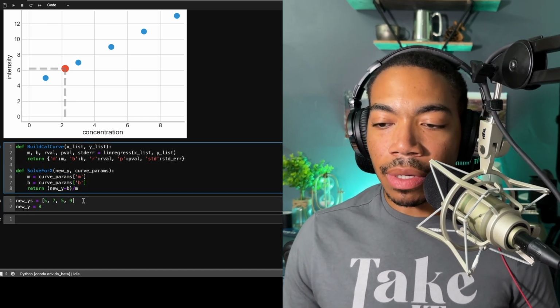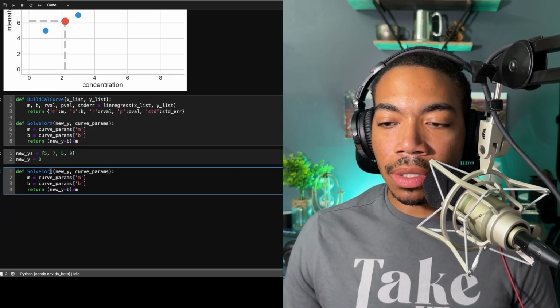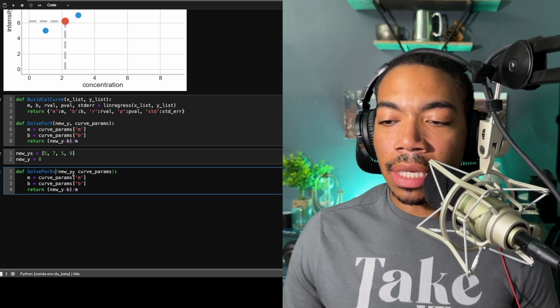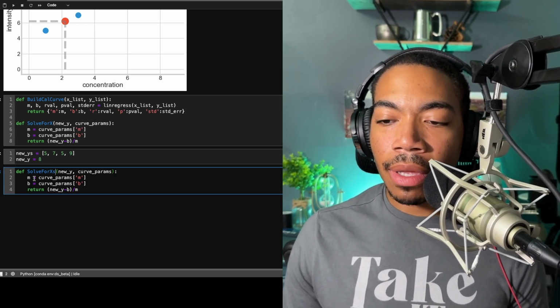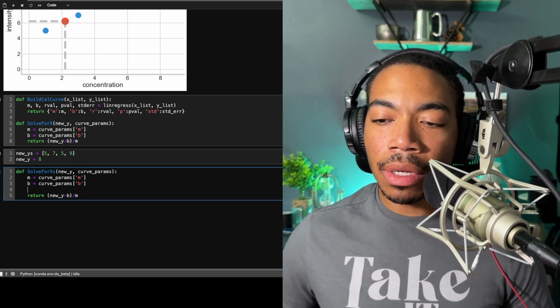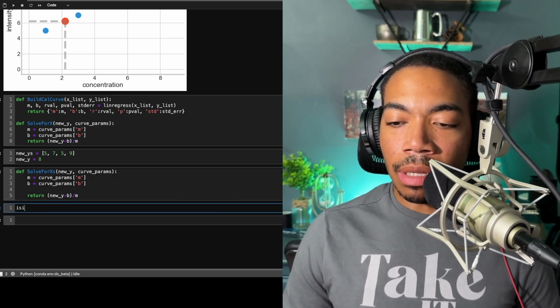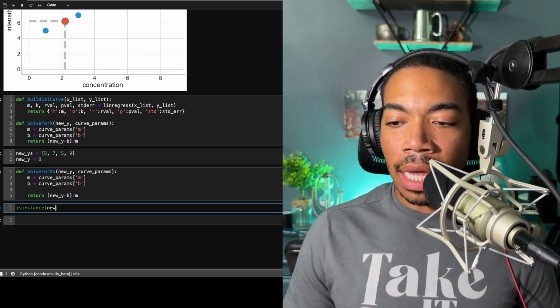So the first thing I want to do is copy this function and start, and we'll just call it solve for, let's just say X's. And it will take in some Y value. The curve parameter stays the same. The M and B will stay the same, but we're going to add a little bit of extra in the middle to check the type of value for new Y. So to do this, we're going to use a method called isinstance. And let's take a look at how this works.